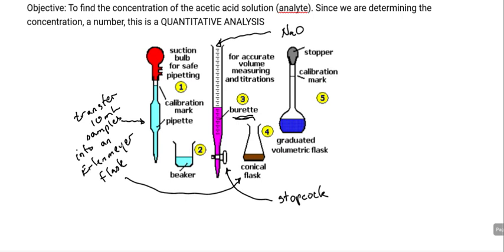So our sodium hydroxide is going to go here, and of course the sodium hydroxide is not a purplish or pinkish color. It is colorless. We're going to put our sodium hydroxide in the burette, and we know the concentration of the sodium hydroxide. It is 0.500 moles per liter.